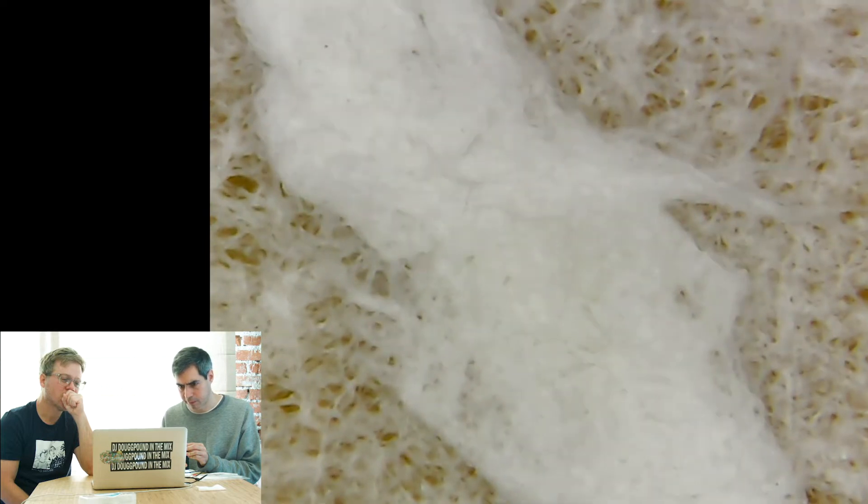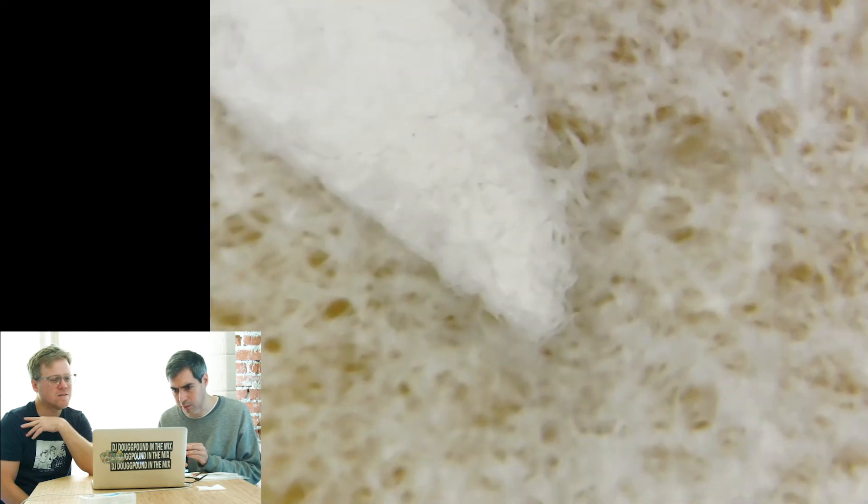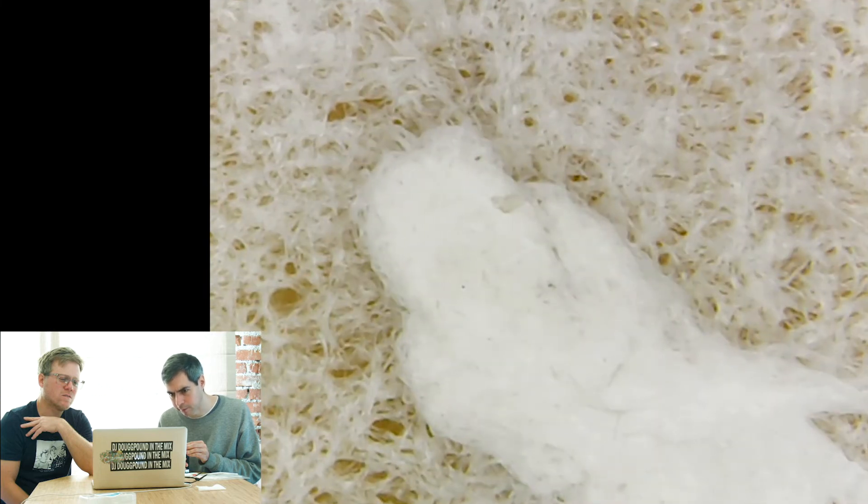Let's see what else is in here. So this is just a little piece of — I don't know what this is. I saw this in the bathroom. It could be a little piece of paper or something. I just thought, what is this? You know how you just see little pieces of paper, a speck of something? I wonder what that looks like up close. It's kind of some kind of little piece of paper or something. It looks like it's probably toilet paper — just a little speck of toilet paper or something. It's kind of folded up.